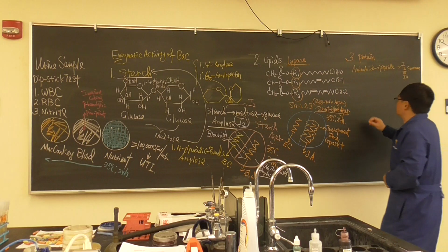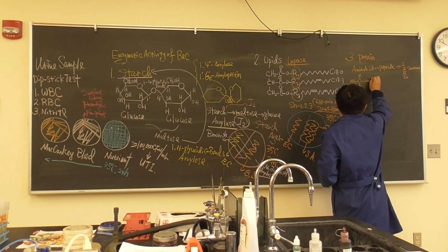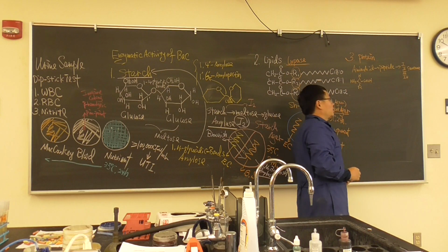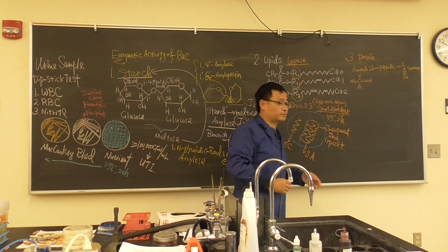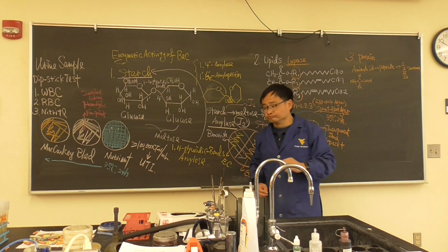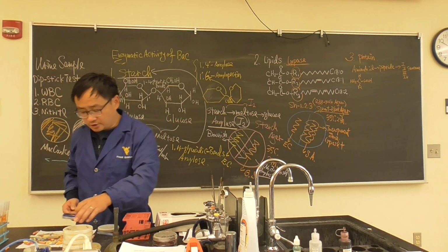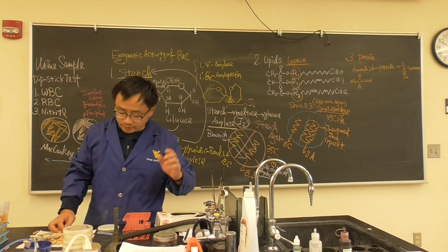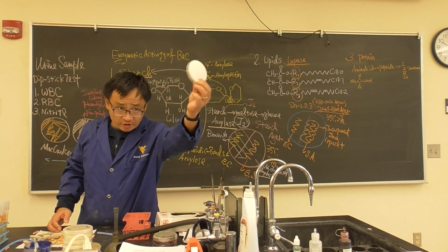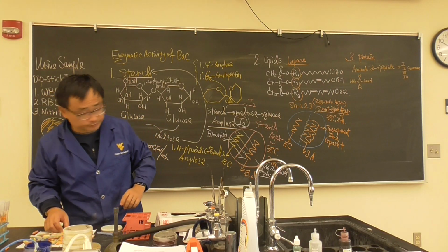So amino acids, we mentioned that. Amino group, H, the difference is R, COOH, carboxyl group and the amino group. So we'll mention that in exam 3 in detail. Okay, using protein. Which food products have a lot of protein? This agar, skim milk agar.